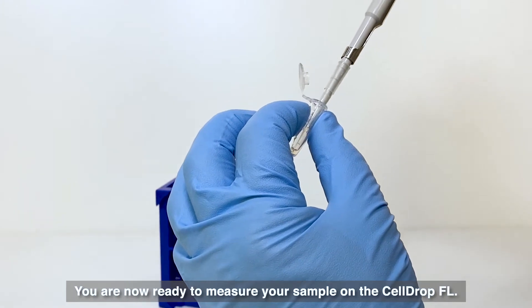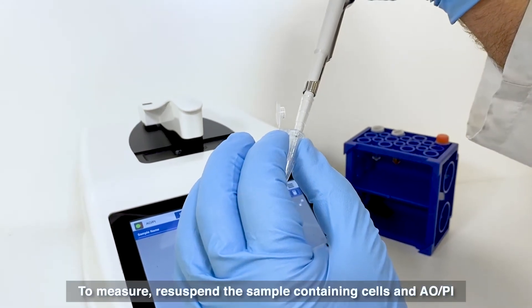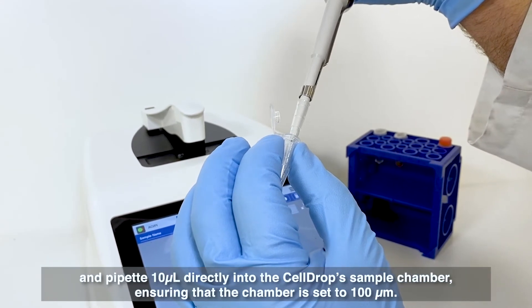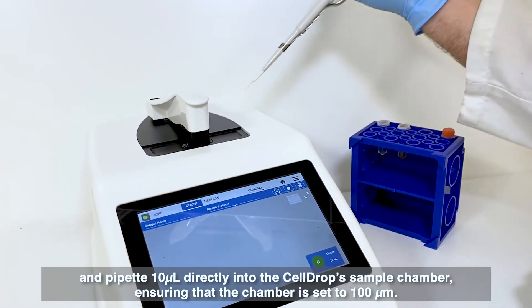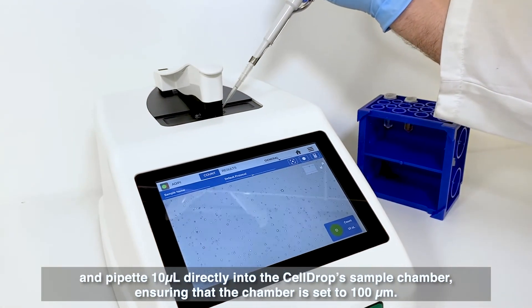You are now ready to measure your sample on the CellDrop FL. To measure, re-suspend the sample containing cells in AOPI and pipet 10 microliters directly into the CellDrop sample chamber, ensuring that the chamber is set to 100 microns.